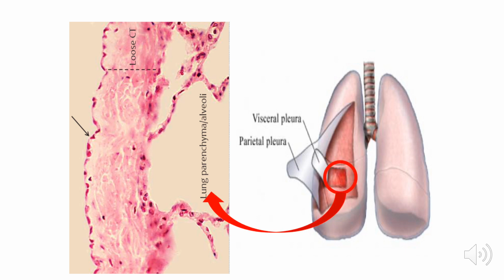This is the cut section of the lungs. You have in here the presence of alveoli. And then this is the cut section of the visceral pleura. What do you notice? It is found on the surface of the lungs. And then you have their simple squamous epithelium.